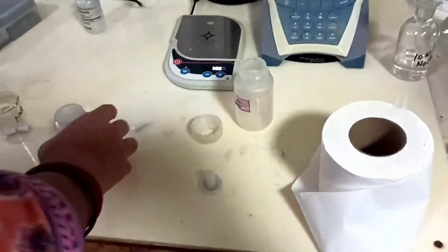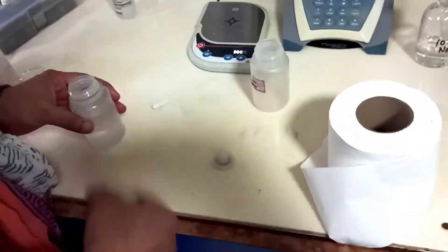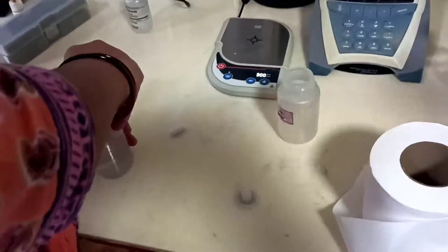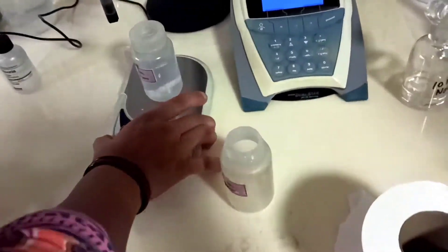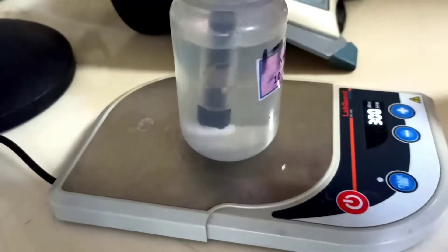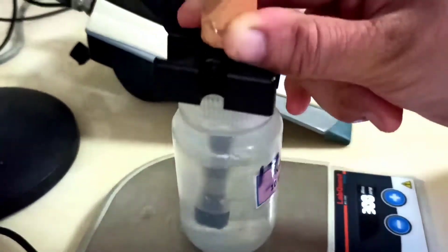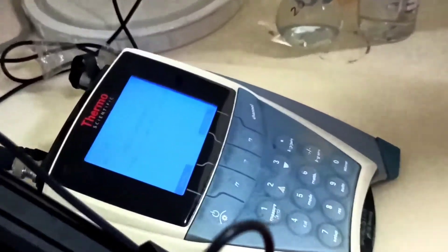We are taking our first standard, 1 ppm. We take 100 ml in a plastic bottle. We are using such type of plastic bottle in which only the electrode is deep and the ammonia cannot be liberated outside. We add 1 ml buffer for maintaining the pH 11, in which the whole ammonia is liberating out.